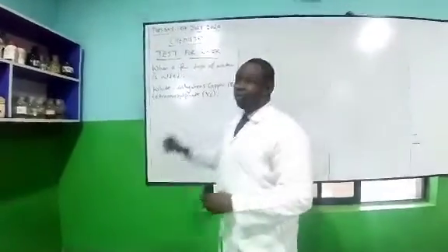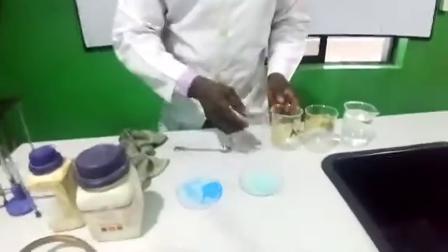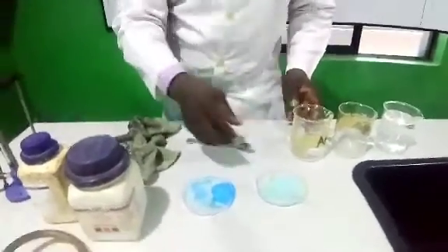I am not going to write the result down. I am only going to perform the small experiment and let's see what happens.